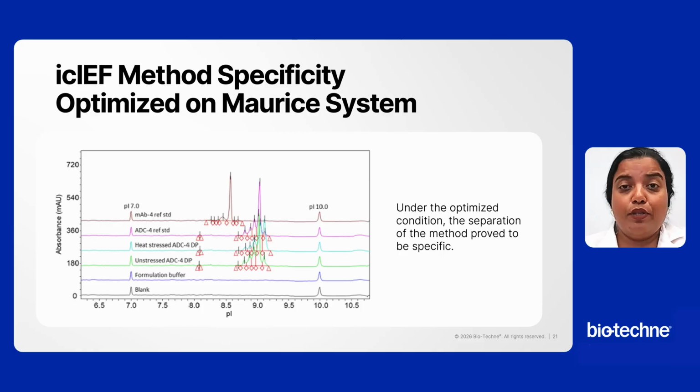The stressed sample showed increased basic variant and with well-defined separation of both acidic and basic peaks compared to the unstressed sample. The method was able to differentiate the mAb from the ADC once it was optimized on the Maurice system.